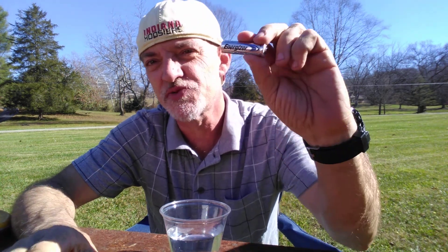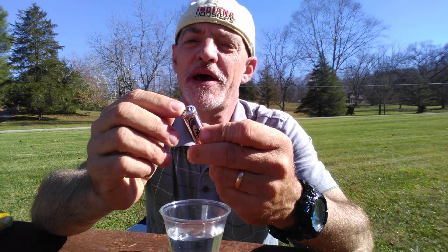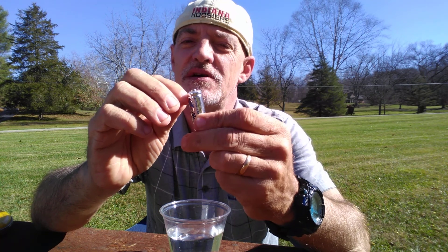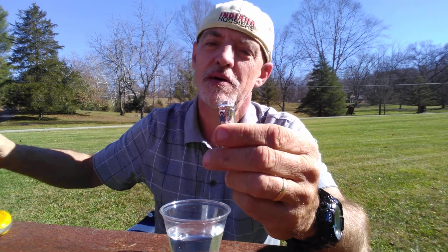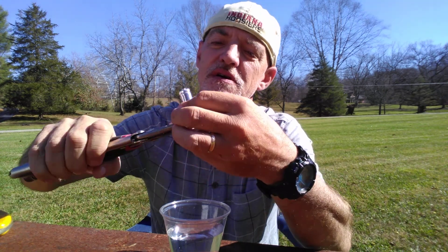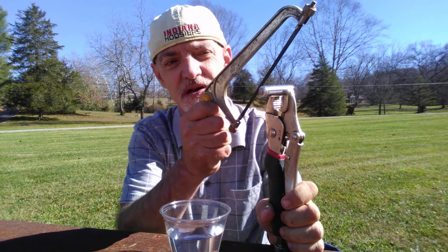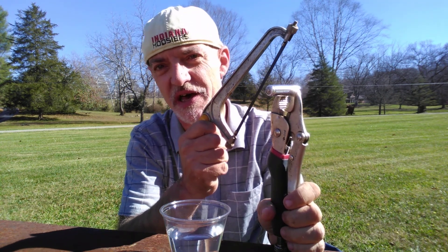Hi. Today I'm going to be extracting lithium from an Energizer lithium battery. I'm taking the top of the battery, right where the little ridge is underneath the positive terminal. I'm going to take locking pliers to hold it solidly in place, and then right where that groove is, I'm going to completely cut off the top of the positive side of the battery.